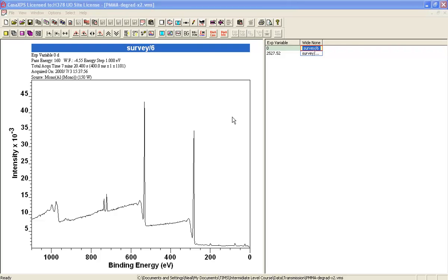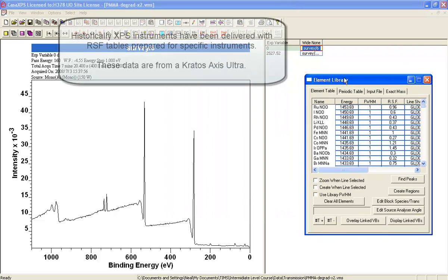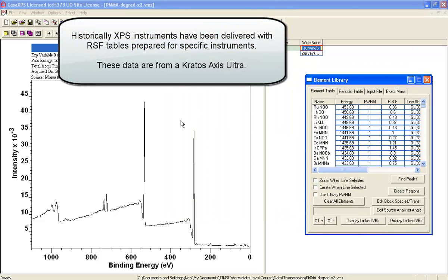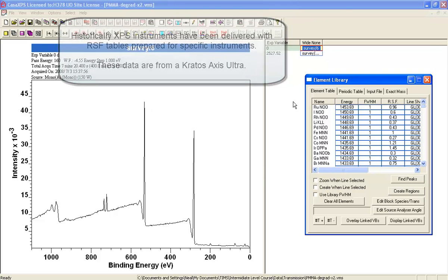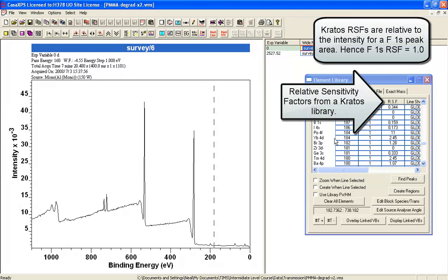We'll begin by using the relative sensitivity factors and the element library that is delivered with the instrument that measures these data. Since this is from a Kratos-Axis-Ultra, we have an element library set up for a Kratos system with the Kratos RSFs.